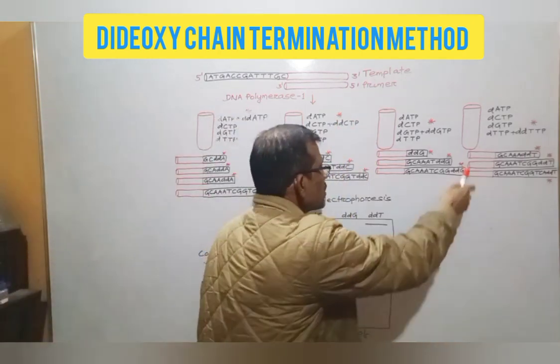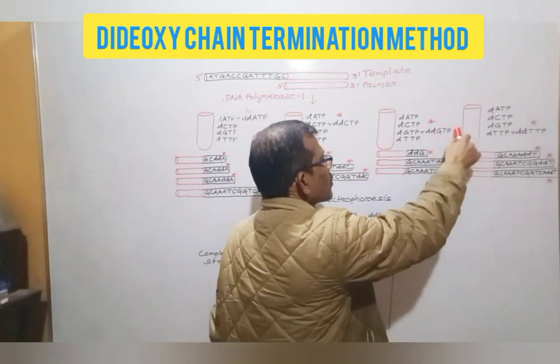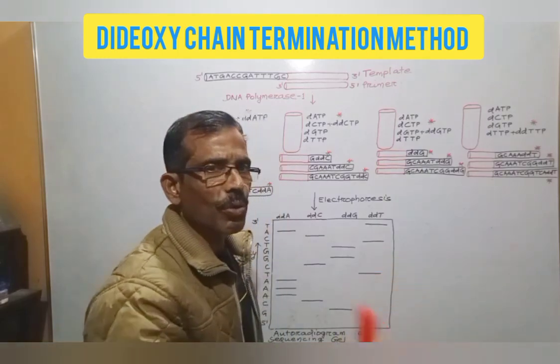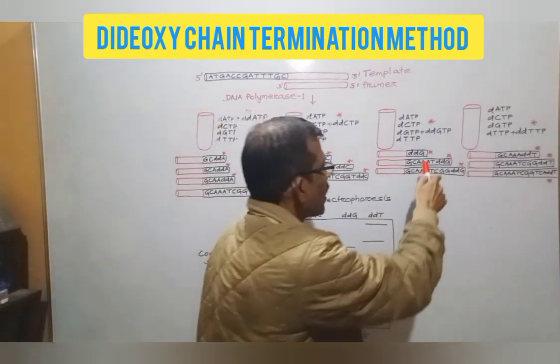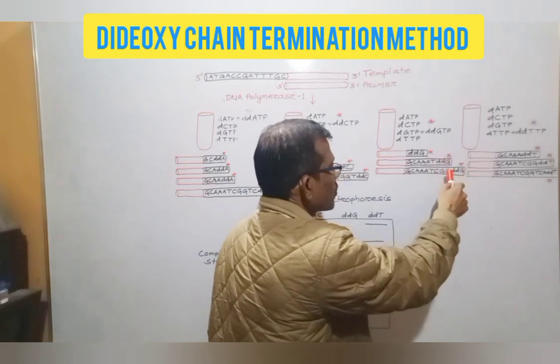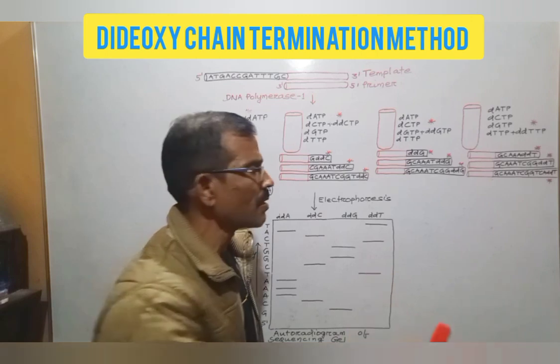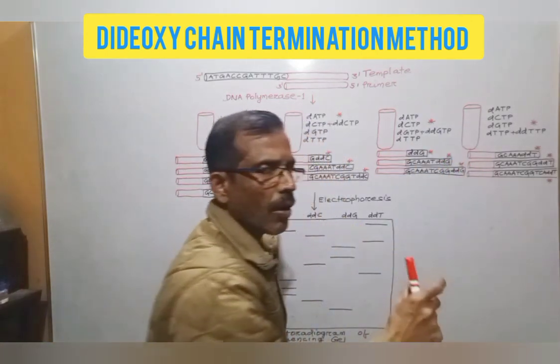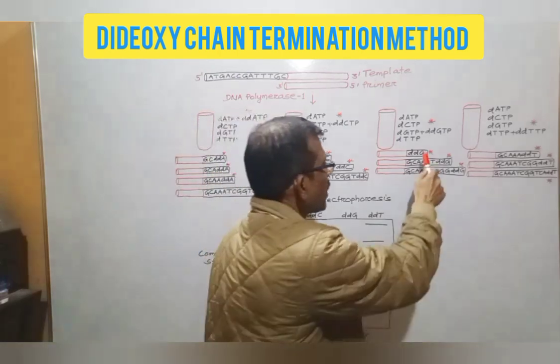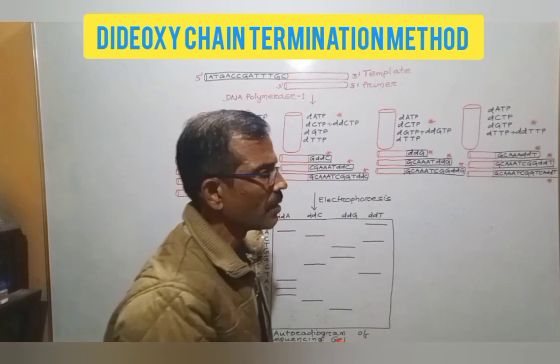But in batch 3 chemical reaction, dideoxyguanosine triphosphate is included, because of which replication will be interrupted when a dideoxyguanosine triphosphate is added to the growing DNA strand. As a result, 3 different DNA fragments will be obtained, all of which have dideoxyguanosine triphosphate at the 3' end.